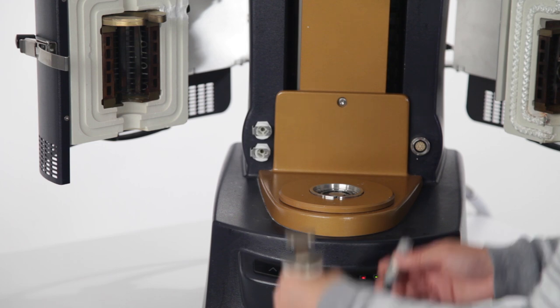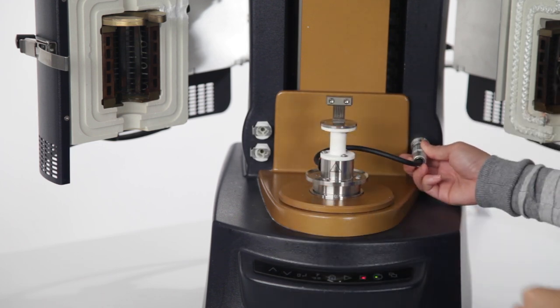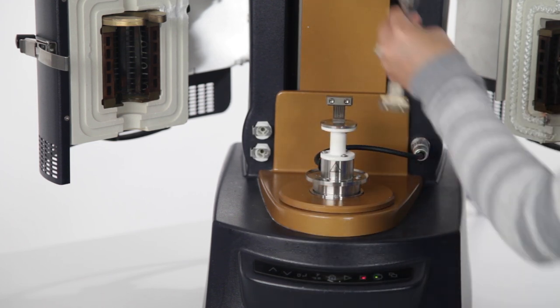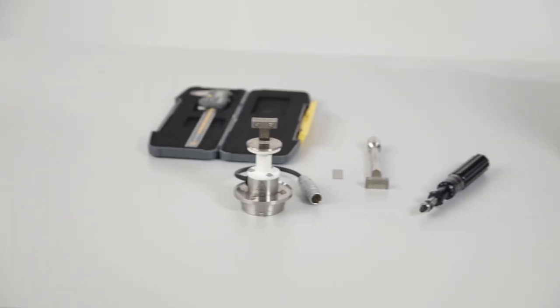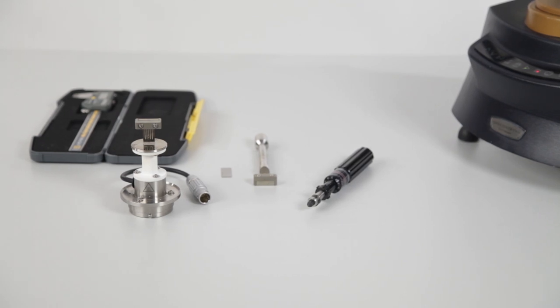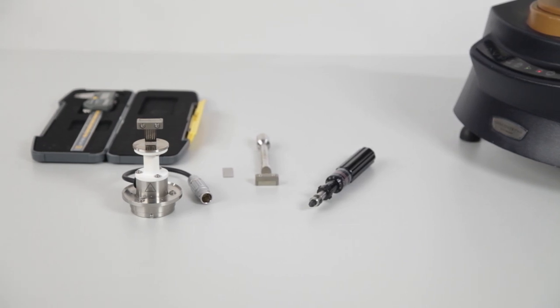When mounted on the DHR, the linear film tension clamp is used in tandem with the environmental test chamber for temperature control. The kit includes the upper and lower fixtures, alignment steel shim, torque wrench, and calipers.